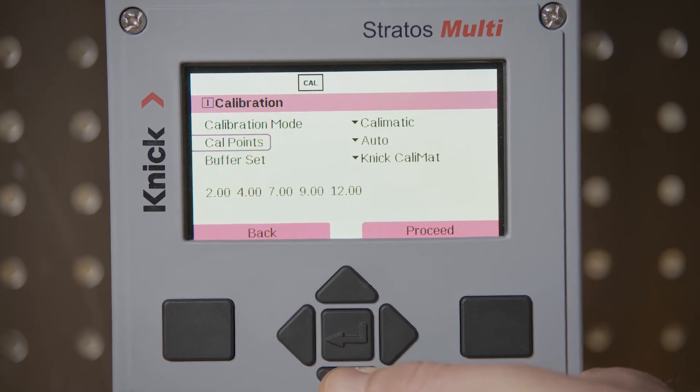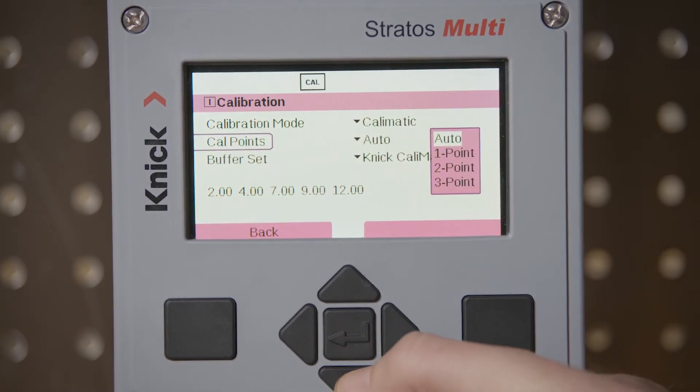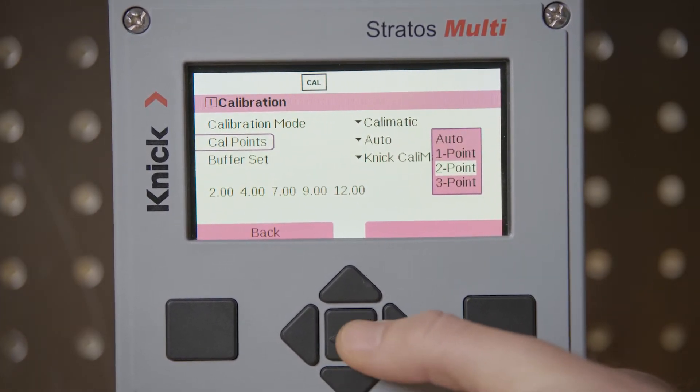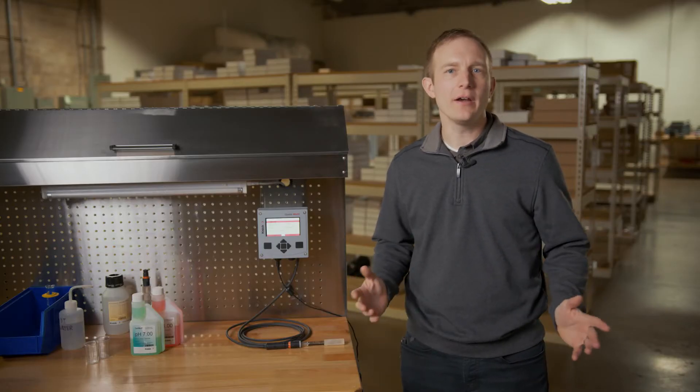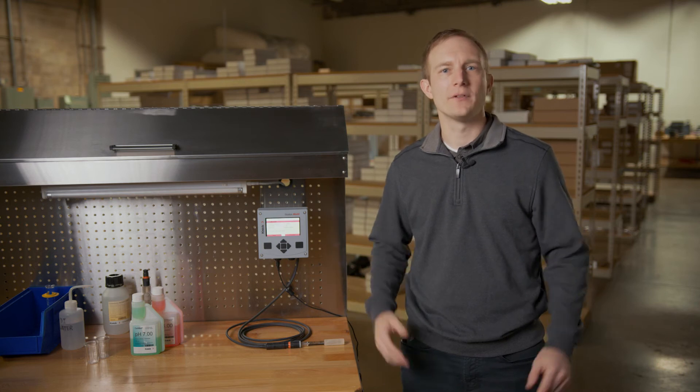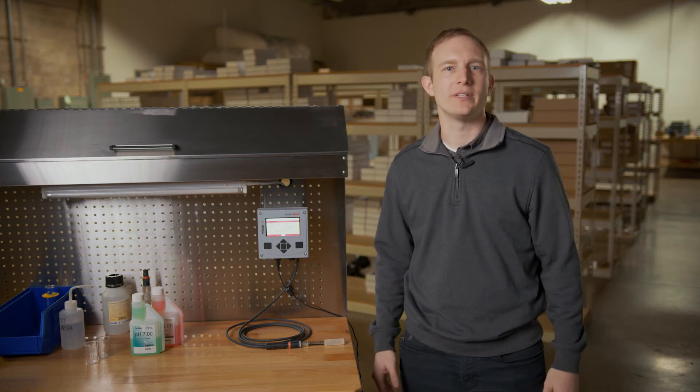Under the number of calibration points we will select two point and then move on to the selection of our buffer set. As we are performing an automatic calibration it is very important that we have the proper buffer set selected in our Stratus Multi transmitter. This ensures automatic recognition of the buffer values as well as automatic temperature compensation during the calibration process.